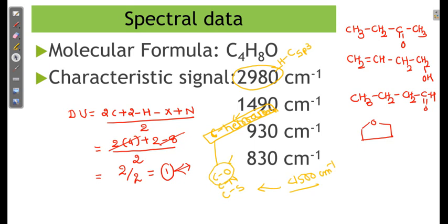The ketone structure is not possible because if carbonyl is there, the characteristic signal is about 1700 cm⁻¹, which is not present. The OH structure is also not possible because that characteristic signal is about 3500 cm⁻¹, which is also not there. The aldehyde also has a characteristic signal at 1700 cm⁻¹, but that's also not present.